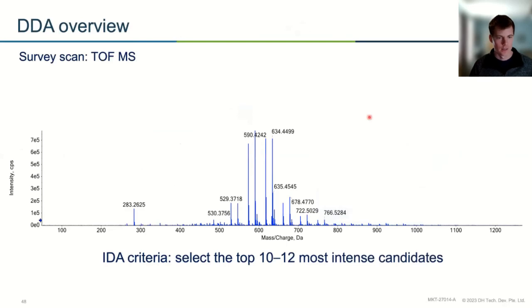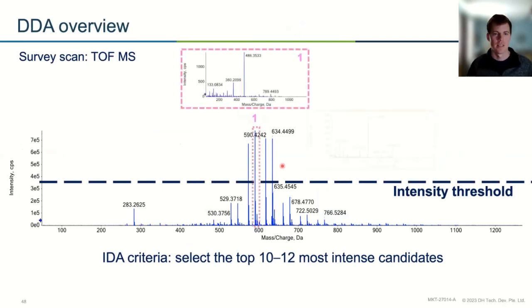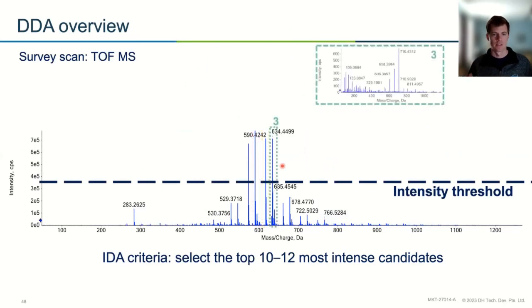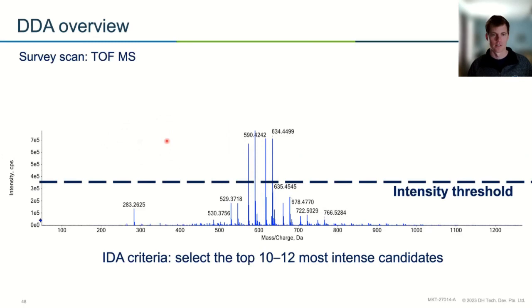This looks like, in this example, we are going to set a threshold. So we have a mass spectrum, right? Mass to charge by intensity. And you can see in the spectrum, there are these 4 peaks that popped out. So what we want to do, in real time, is have the mass spec take each of those peaks and do a full fragmentation analysis.